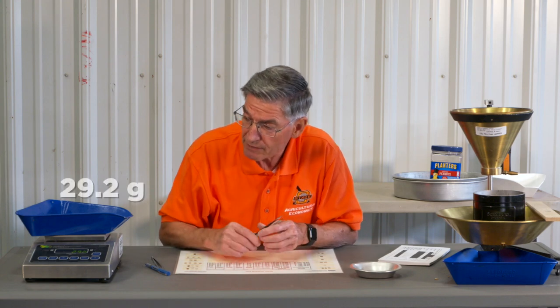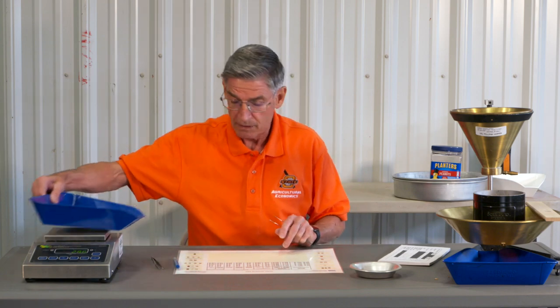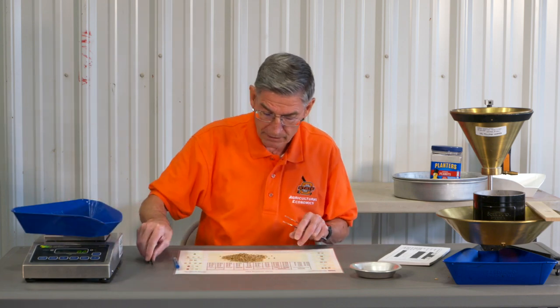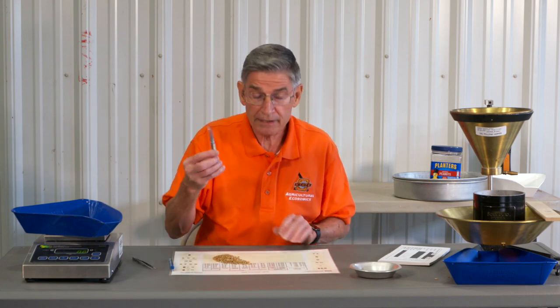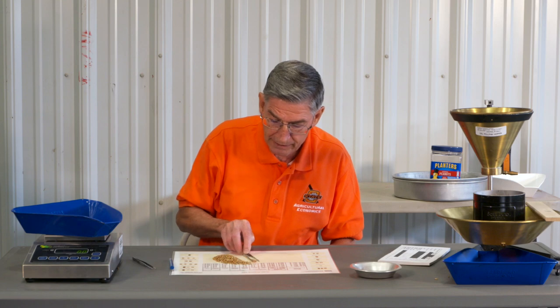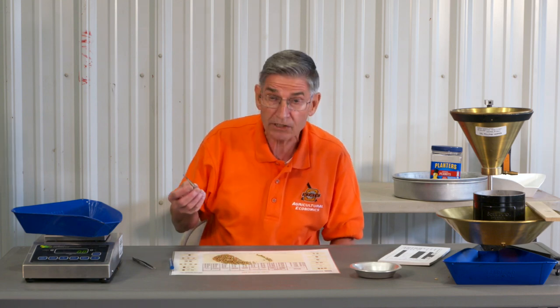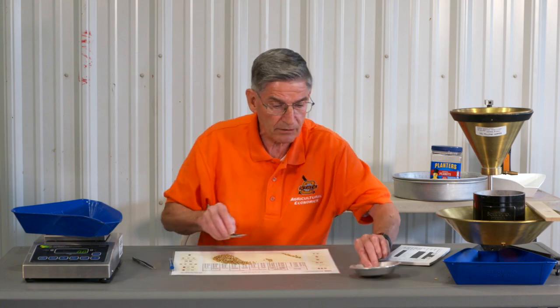When picking foreign material, you want about 30 grams of wheat in the sample. In this one I've got 29.2 grams, so I write it on my pad. I pour the sample and make a little pile in the corner, then take my tweezers and make a line of wheat so I can see the kernels and easily pick out the foreign material, putting it in my pan.